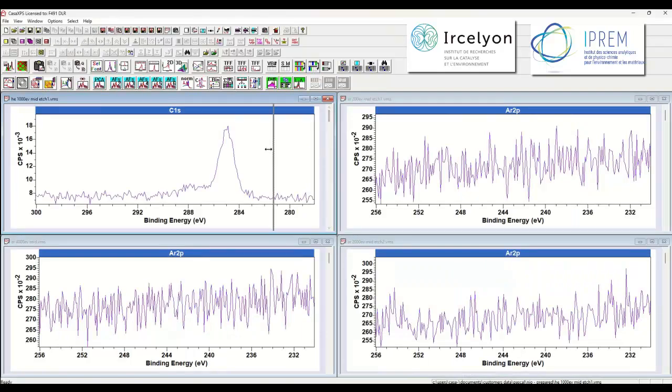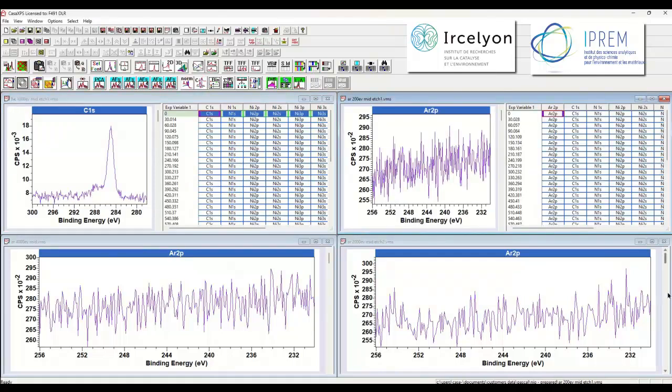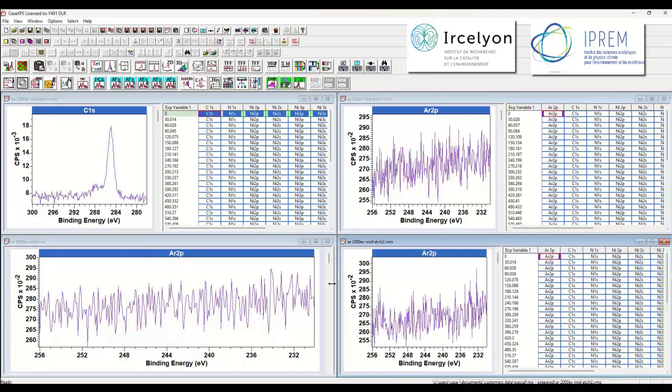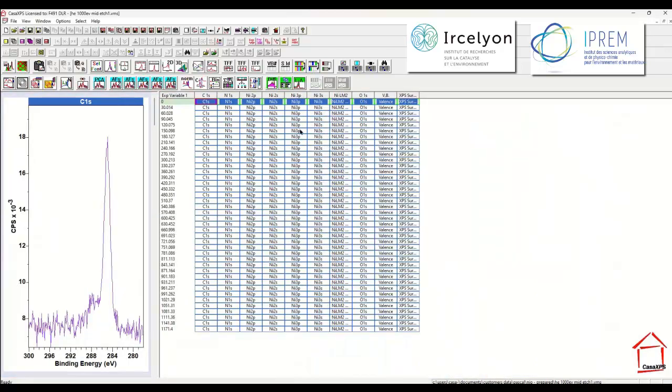So we can see here we've got four data files. Each one of these data files represents a different experiment on a nickel oxide, and these experiments represent sputtering the surface with ions, and the species vary. I've got a helium or I've got an argon species, and the energy of these ions differs between these data files. But other than that, the experiments are identical in terms of the definition. I'm now going to choose one of these files and start the preparation of the profile.